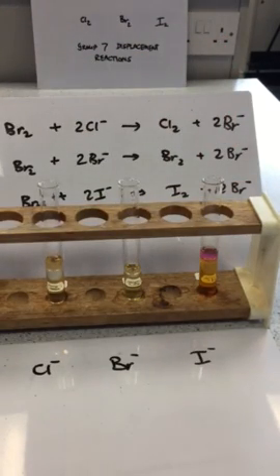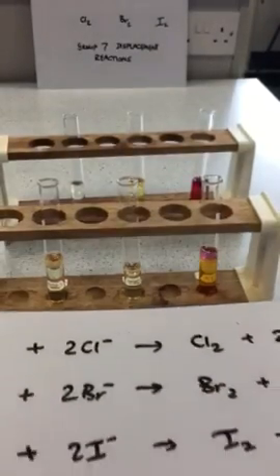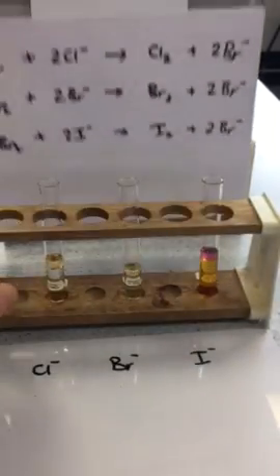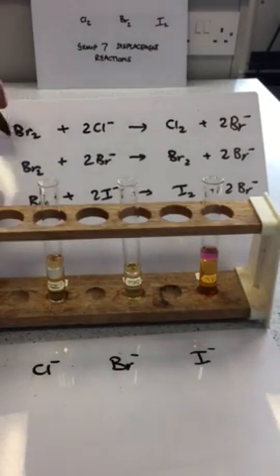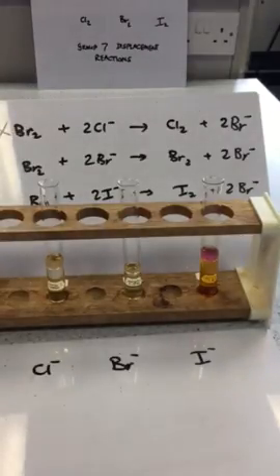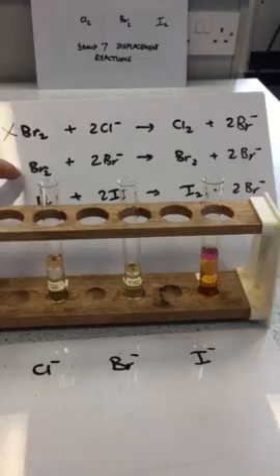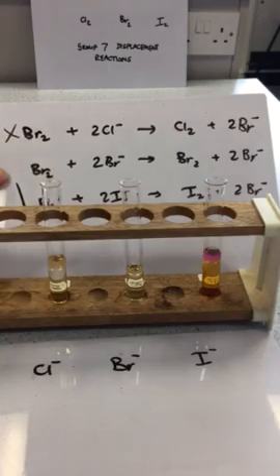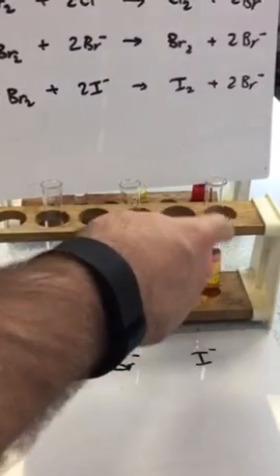So, as a summary, we can say that this first reaction of bromine with chloride, that is no reaction. Okay, the reaction may be occurring here, but we don't observe it. But there is definitely a reaction here between bromine and iodide at the bottom to form iodine.